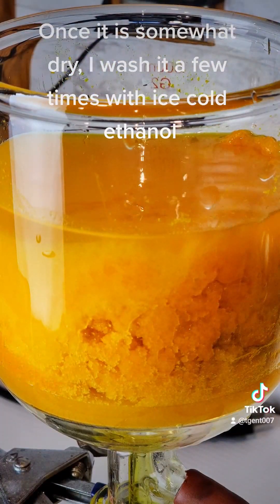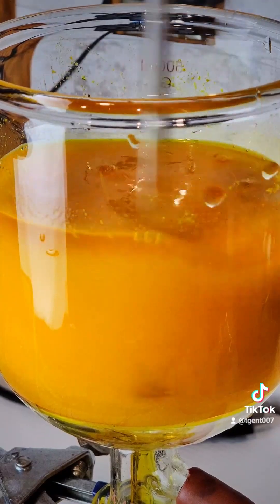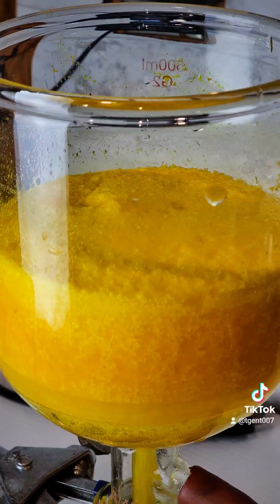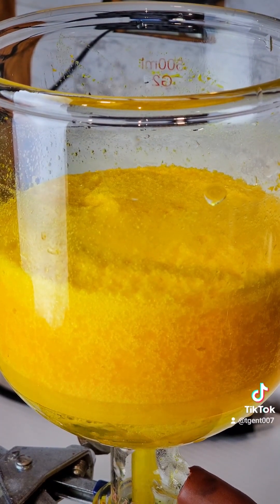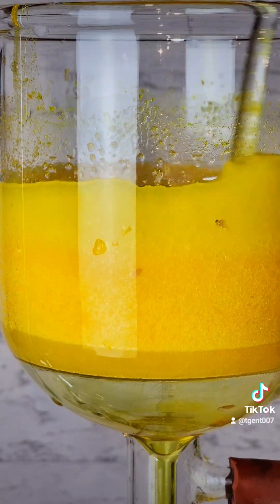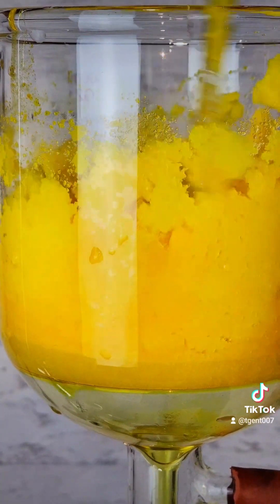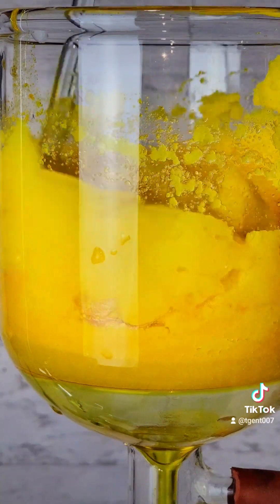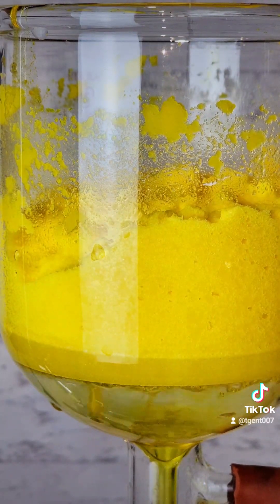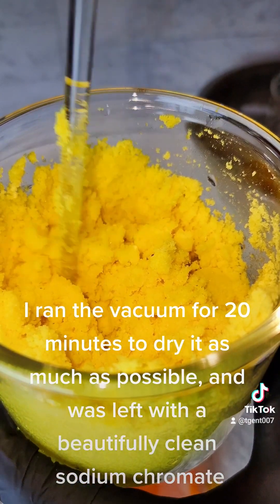Once it is somewhat dry, I wash it a few times with ice-cold ethanol. Sodium chromate is virtually insoluble in cold ethanol, so I won't lose product here. As it is cleaned up, the bright yellow color becomes apparent. I ran the vacuum for 20 minutes to dry it as much as possible and was left with a beautifully clean sodium chromate.